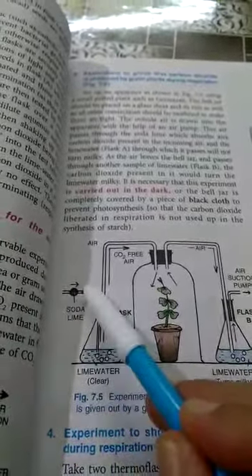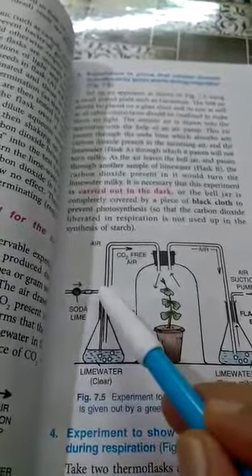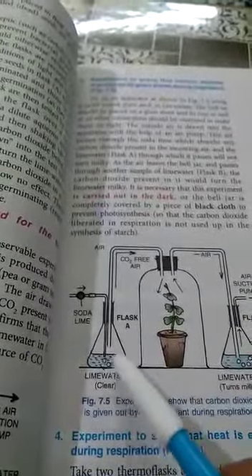When air passes through soda lime, the soda lime will absorb carbon dioxide. So when this carbon dioxide free air passes into flask A, the color of the lime water will not change, because this air does not have carbon dioxide in it.